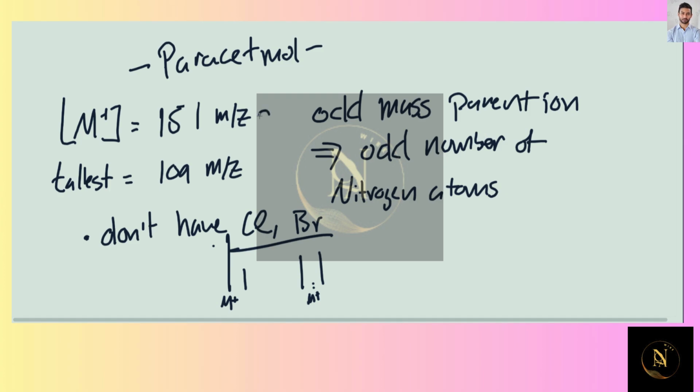The next observation you could make is that you've got a gap of 42. Right? So a gap of 42 atoms in mass also tells you something, right? I'm just doing this as 151 minus 109. Essentially, what it's implying is that you've got some functional group or combination of atoms that can be easily cleaved that have a mass of 42. That's the point you can make with that.